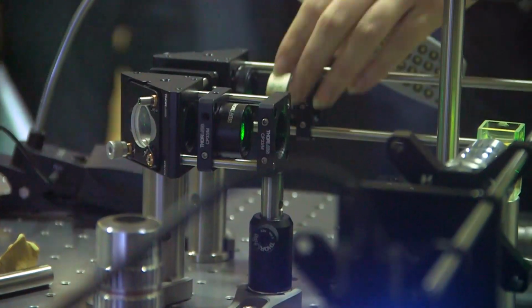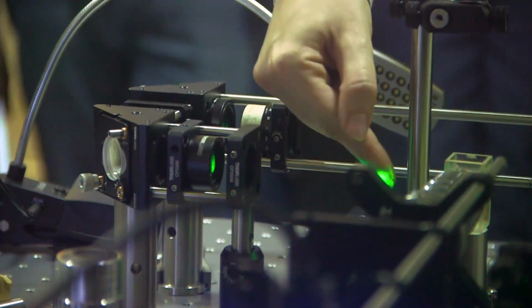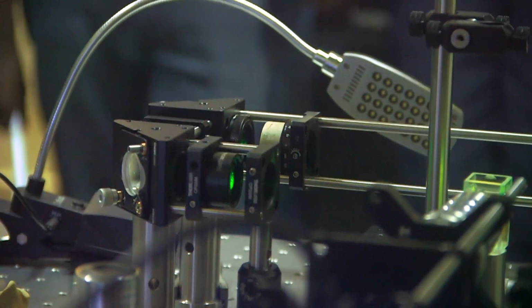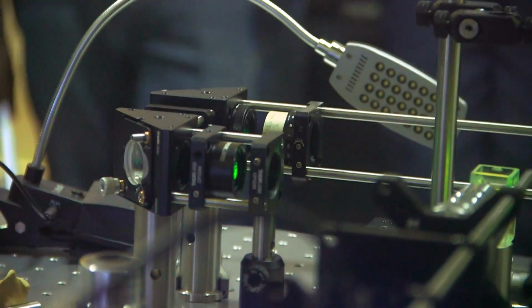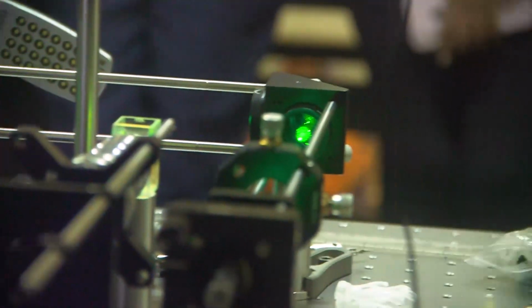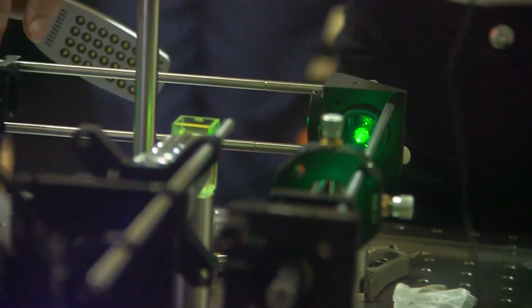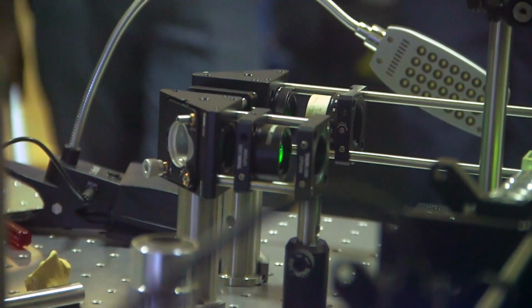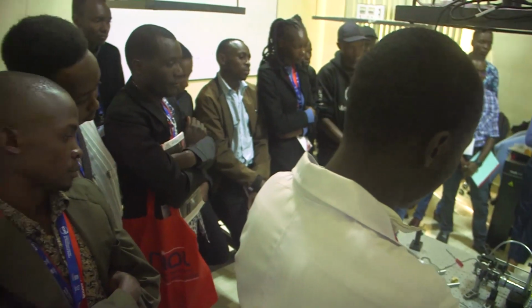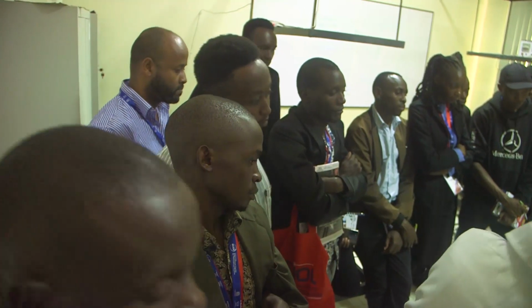All right. Now, I could have put this lens just here and illuminated a blade of sample, and collected the fluorescence with my detection line. But I decided not to do that. The reason is that this lens will create a waist that is very small, and it has to be matched with the field of view of this objective. It's not very easy to do.